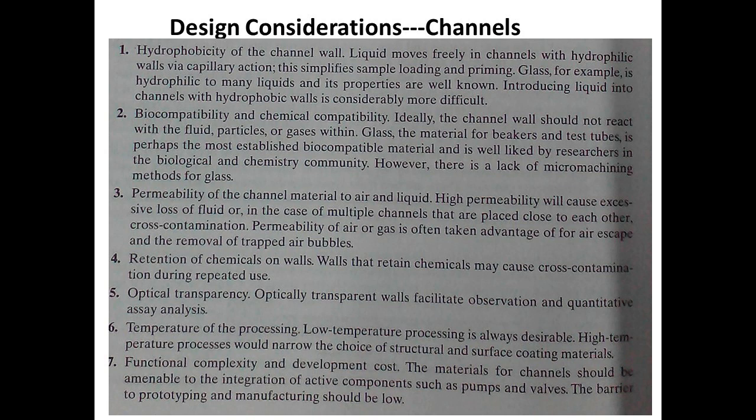But sometimes you have to play around. Sometimes you need the material to have some permeability properties, so that the air or gas can be removed and not trapped as air bubbles.